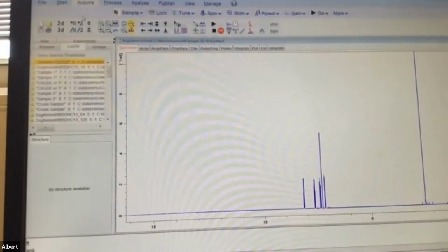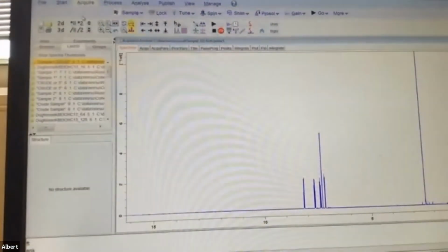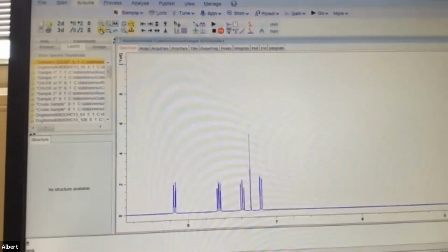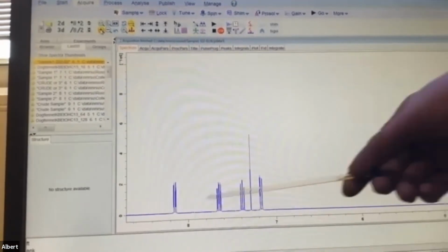So those 4 H's that I showed you upstairs on the ring, each one of these signals corresponds to one of those H's. The thicker ones, not the tall one. Yeah, if you click the button, the magnifying glass, the plus. This here. Oh, right there. Click it again. All right, you can see that those peaks are not just single lines, right? They're split up.